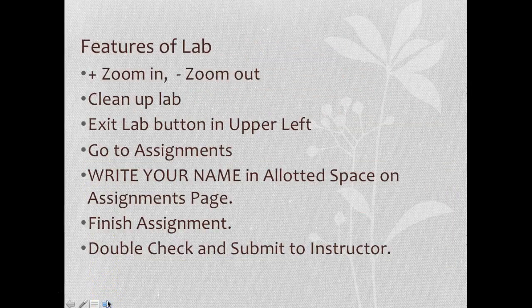Okay, so you can zoom in and out using the plus minus tabs at the bottom of the screen. Clean up the lab, exit, and then go to assignments. Now write your name in the allotted space. Now this is optional. However, it's good practice to get into the habit of writing your name on your lab report. Okay.